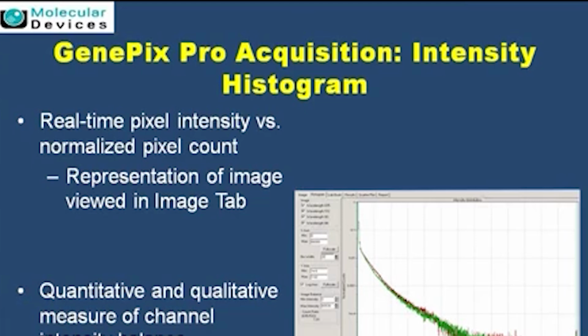I guess now it's time that we should really move on to your software interface and just see how the scanning is really performed using this software. Yes, let's switch to the GUI. Okay, Pankaj, so let's talk about the software and how we can use it for image scanning from the hardware, so that we can see live how one can control different buttons for acquisition of good images. Let's go to the GUI.